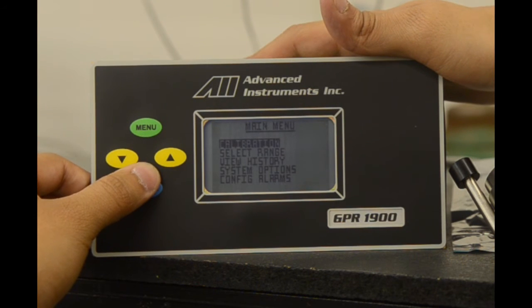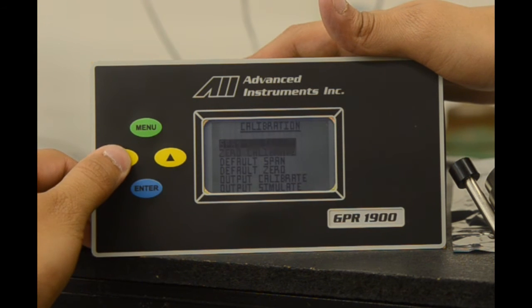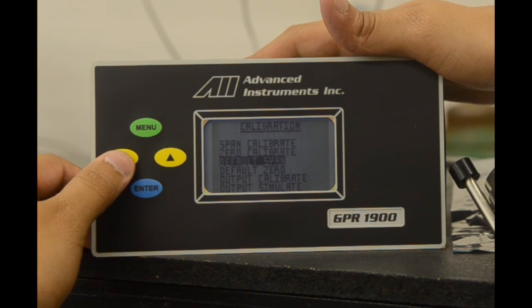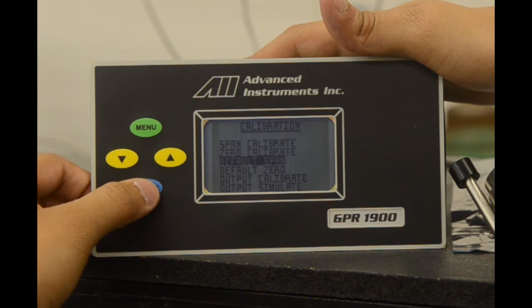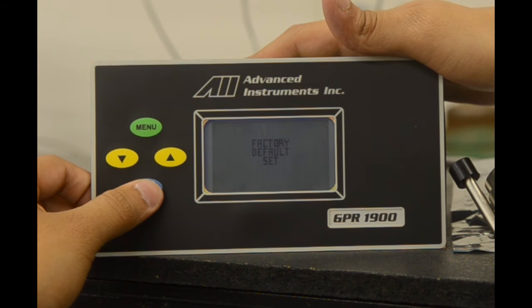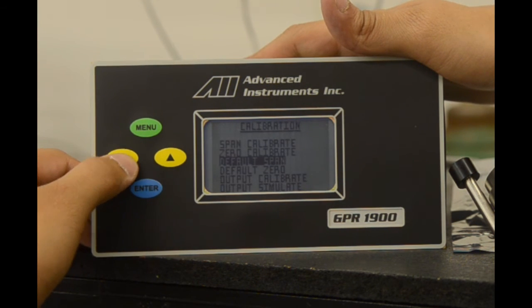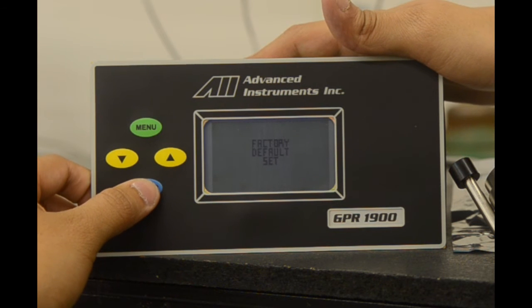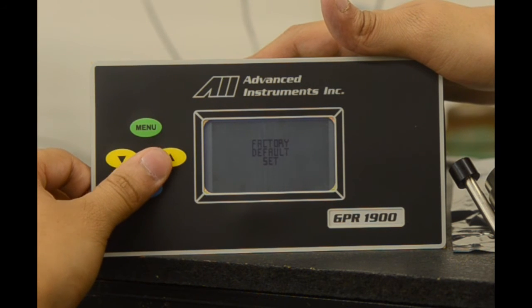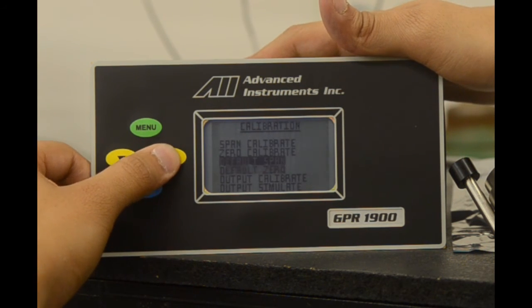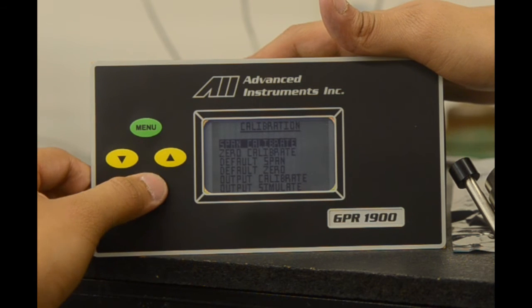We will now perform a calibration. We hit enter on the calibration menu. We'll be taken to the main calibration screen. We'll go down to default span and select enter. This will clear off any prior presets done on the calibration. And we do the same with default zero. As you can see, it will say factory default set.